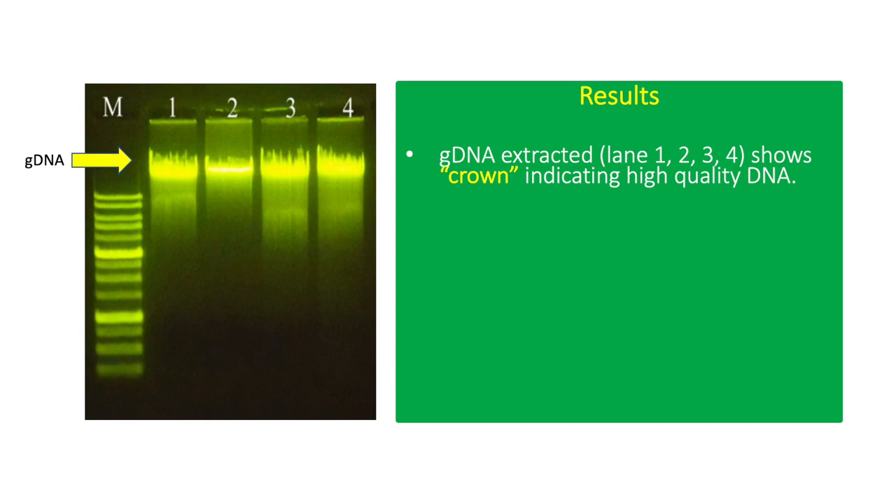The GDNA is commonly observed above the highest band in the DNA ladder, which is only about 10,000 base pairs.